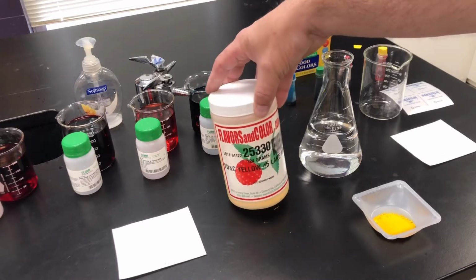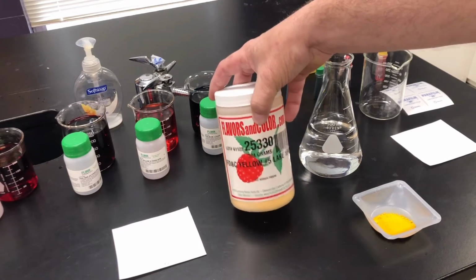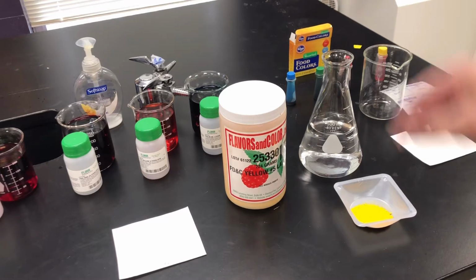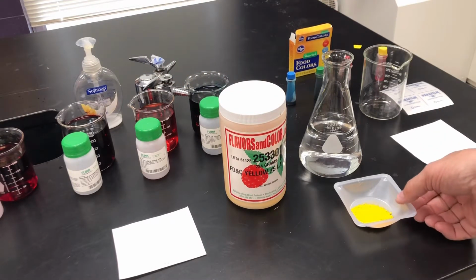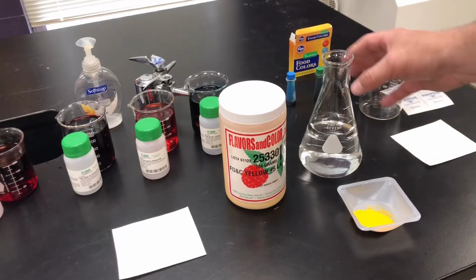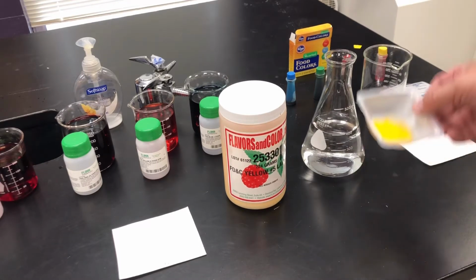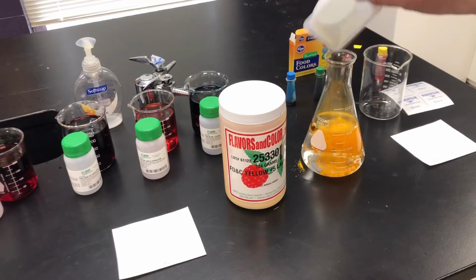So how did we make this stuff? Now here's FD&C yellow number 5, and you'll find out why we're not using this. But here's how we got the 0.5%. All of this comes in 2 grams as our units. If we have 2 grams of this, 2 divided by 400 gives you 0.5%. So we would then add this in here, and oh, that would not give us the correct amount.